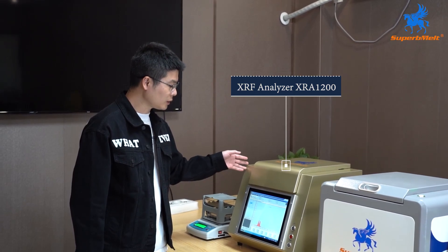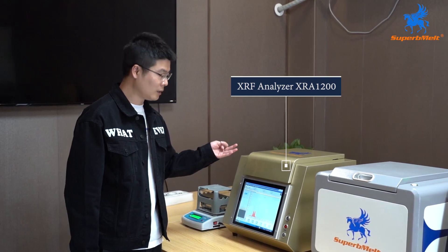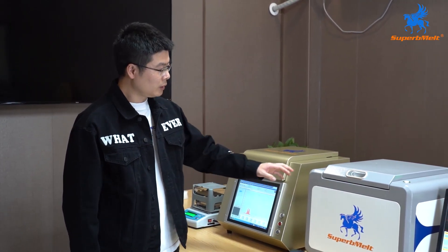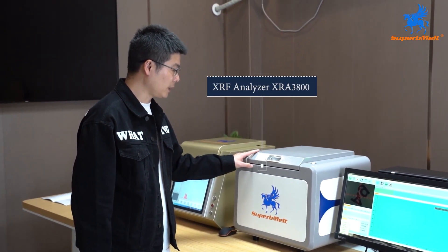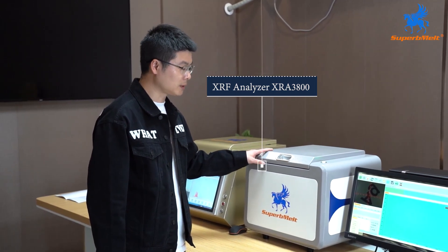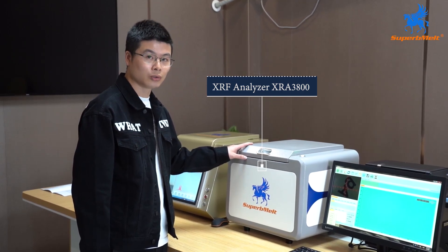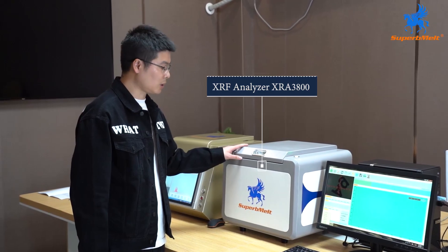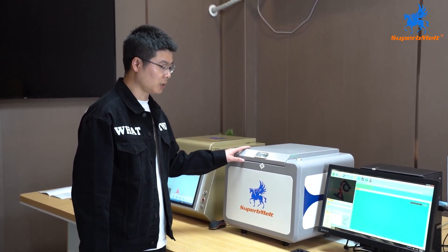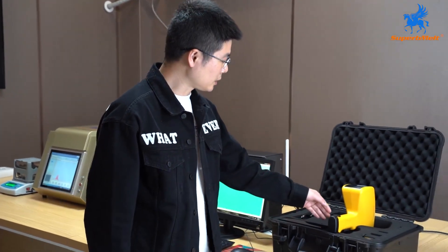With a friendly user interface, the XRA 1200 can accurately analyze the purity of four precious metals: gold, silver, platinum, and palladium. The Superb Melt XRF analyzer XRA 3800 is a rapid and highly accurate machine for metal element analysis. Compared with the XRA 1200, the XRA 3800 can test over 70 metal elements, including gold, silver, platinum, palladium, copper, zinc, and more.